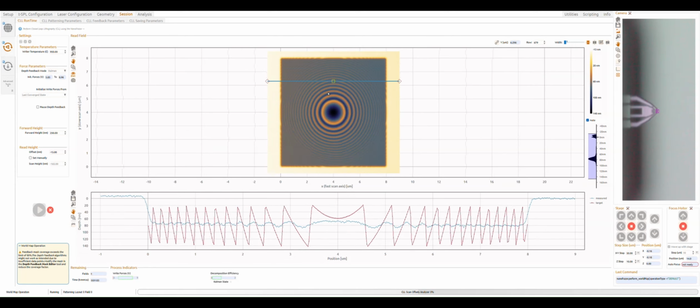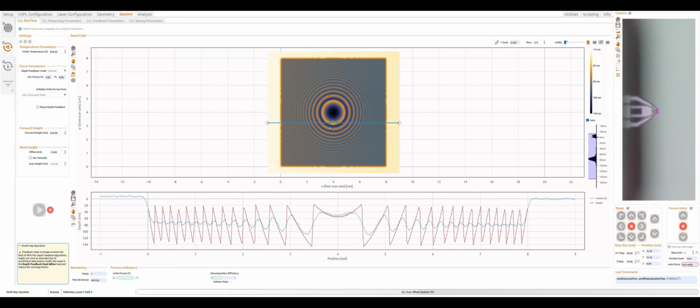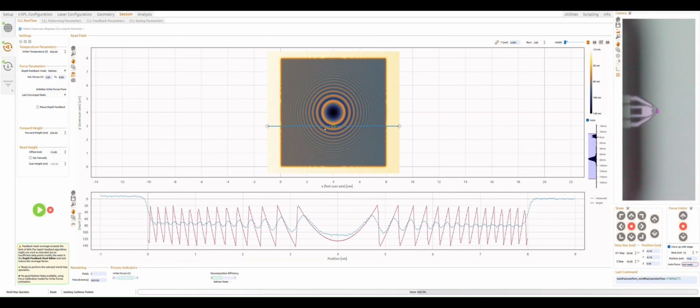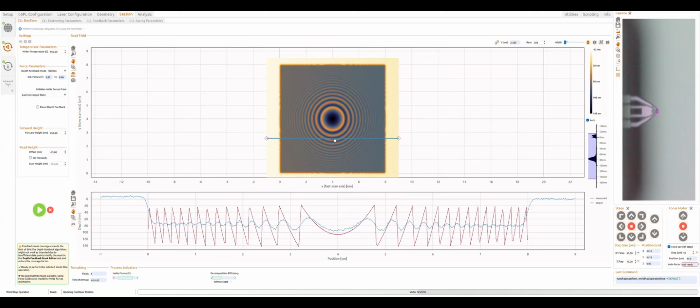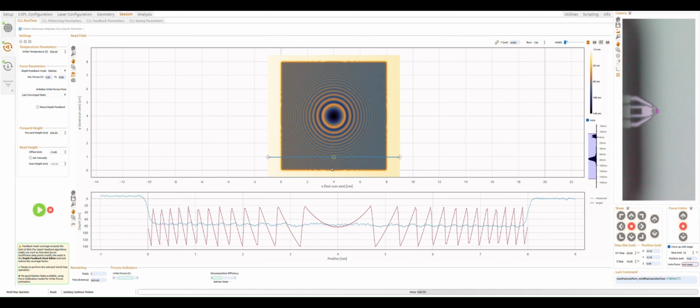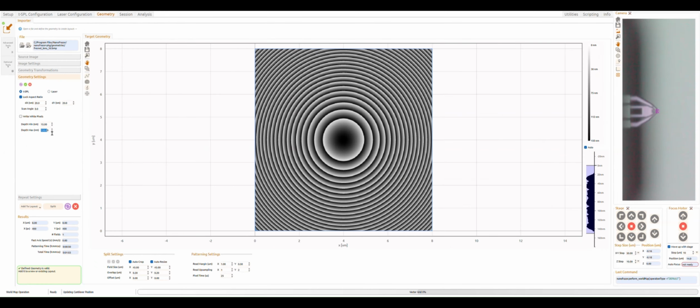And as you can see here, we don't get a good pattern because the parameters that we set are not so great. Of course, this is a sort of simulation of what we may expect, but it's probably not what you will end up obtaining if you pattern on a real sample. The fundamental problem is that here I set an unrealistic depth, which is 150 nanometers.